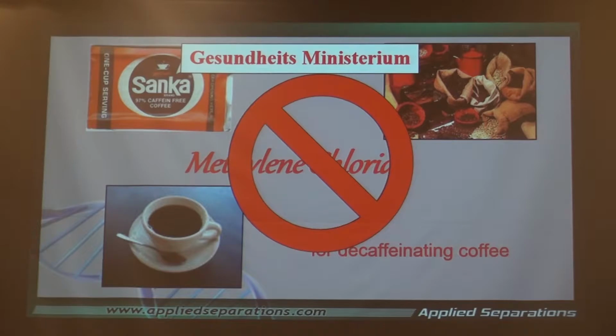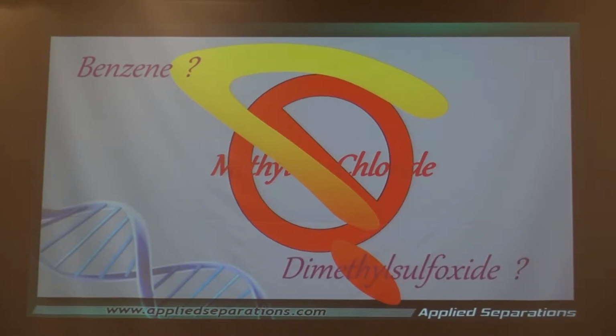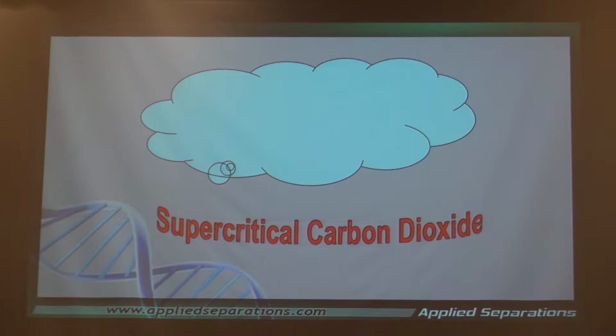So if you couldn't use methylene chloride, what would be some of the alternatives? Benzene? Oh my God. More waste. I don't think so. DMSO? No. Neither of those are good possibilities. So I had to come up with a whole brand new idea, and this was supercritical carbon dioxide.